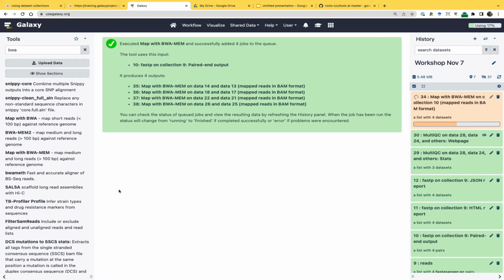There's a config which tells what goes where. And one of the interesting things is that because we have been running Galaxy for more than 10 years, we have accumulated an enormous amount of tool usage data. With this data we can train models and predict, if you start a job on a genome of this size with that many reads, how much time it will take. So it's sort of intelligent job scheduling. Based on our previous experience, we can say this is better sent to a node with 48 cores, or this one doesn't need much computing.